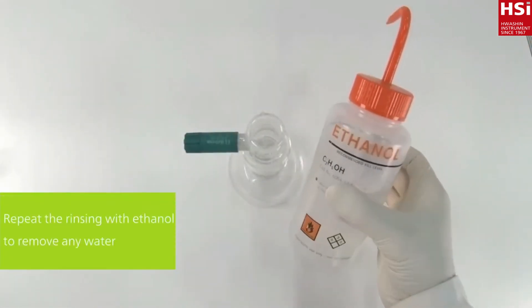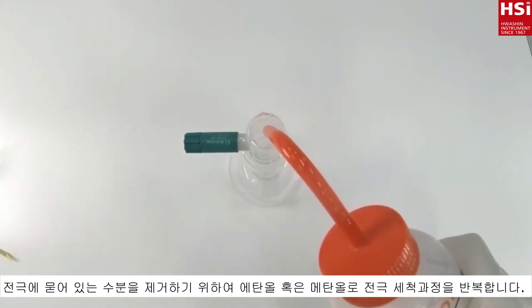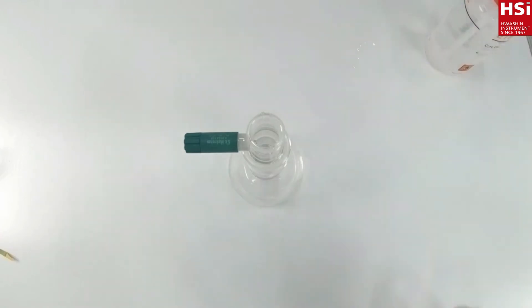To remove the water, repeat with ethanol or methanol. Denatured ethanol must not contain any ketone component.